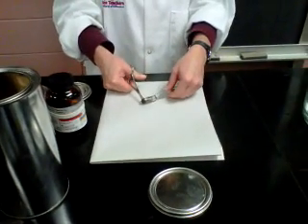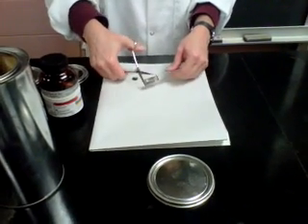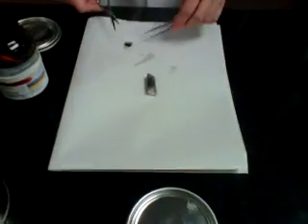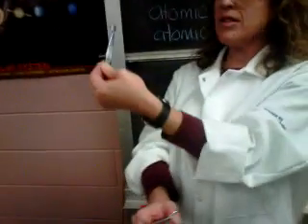They're malleable. Big word for soft. Notice I can cut it with a pair of scissors. Think that's too big? Well, give it a try. That's a pretty good chunk, though. I'd maybe go half that to start with. Let's go half, and then we'll have another piece in case we want to do it again. You'll notice it's shiny. Where I cut it, it's really silvery and shiny.